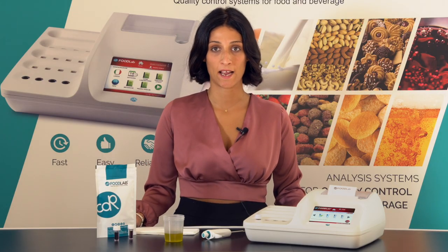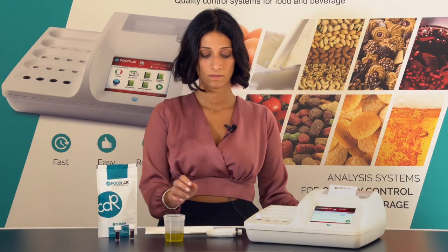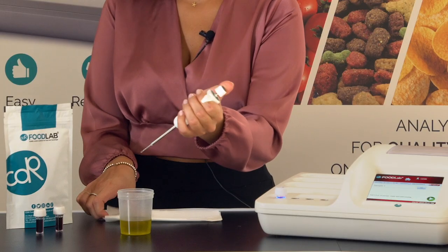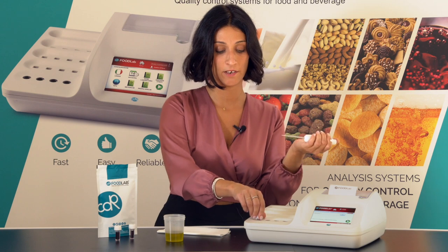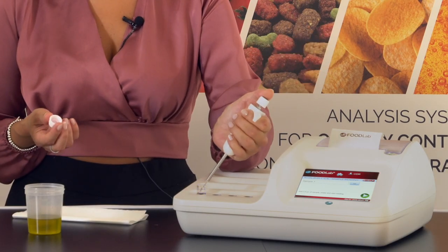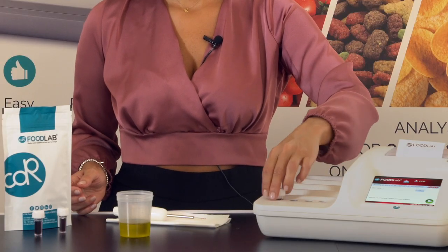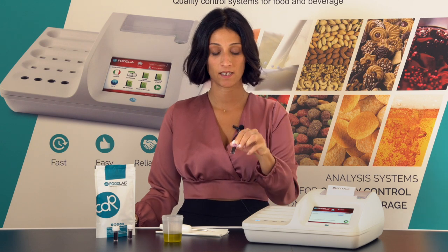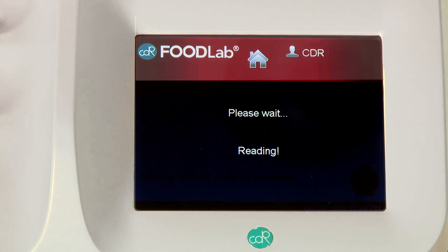I could go on analyzing more samples — two, three, four and so on. Now I have to add the sample in the pre-filled cubit. I will draw 2.5 microliters of oil, wipe the tip, and release it in the pre-filled reagents. Before starting the photometric reading, gently shake the pre-filled reagents and then place it in the reading cell indicated by the blue light. Then press next to start the photometric reading.